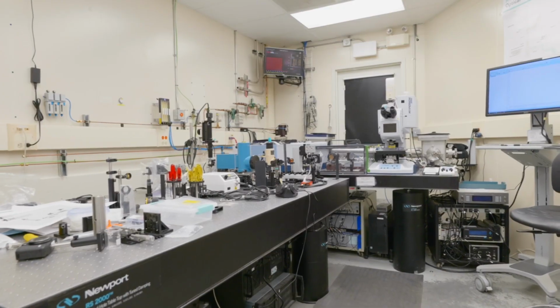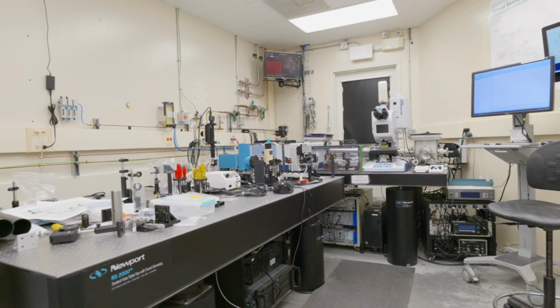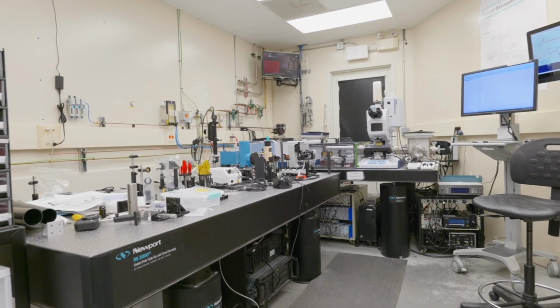We love discussing these problems, particularly if you're already coming to the synchrotron to look at your samples through X-ray beamlines or other beamlines here. There's a lot of complementary information that can be gathered from infrared as well. And so really bringing those two together, or those multiple spectroscopies together, could help solve your problem.